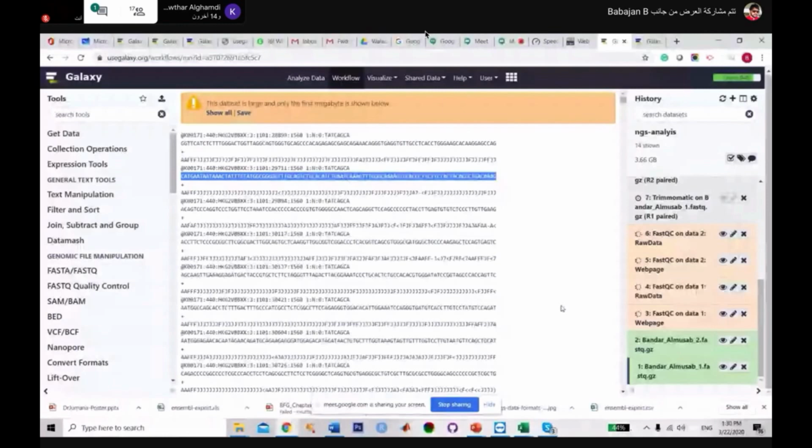Let us see this one. It is still working; it's not going to take much time, mostly 5 to 6 minutes to complete the analysis. If you have FastQC software even on your laptop, you can easily access it. If you type FastQC in Google, you can install it. It's a Java based platform. Once you load your sequence data, it will automatically generate so many graphs for you.